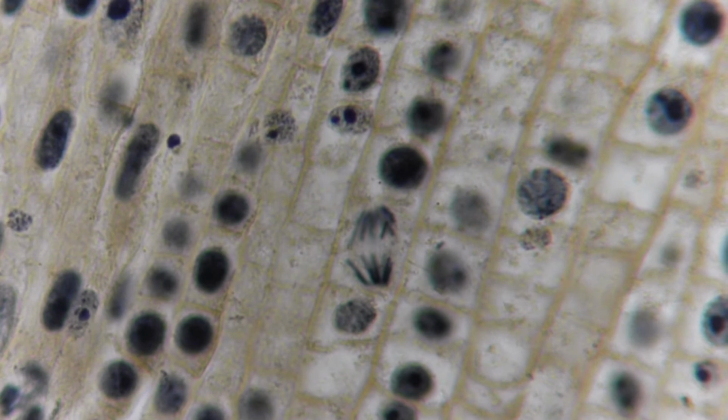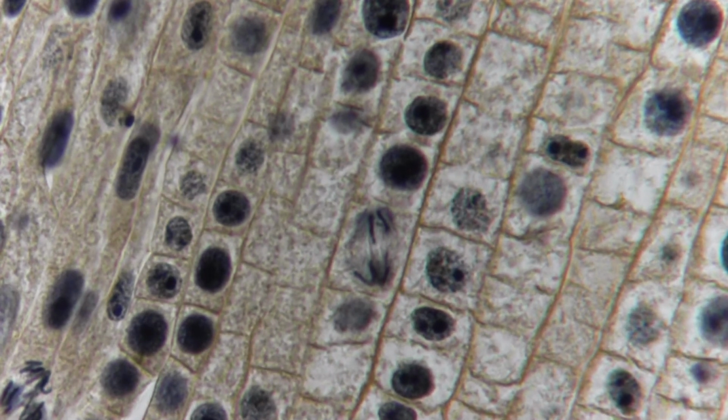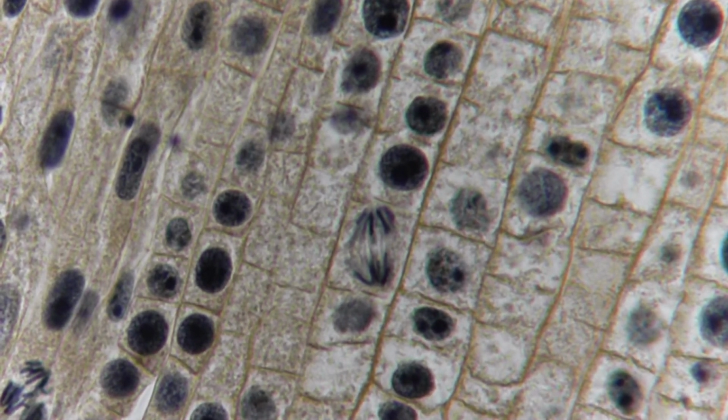Now they're kind of at an angle, and I want to focus up and down on it. Now you can see the spindle figures as I'm looking through the scope. Now the camera may not capture it as distinctly as I see it here. So you see the chromosomes have, half of them went to one end of the cell, and they migrate kind of like to two different poles. And so it looks like a bunch of V's, and they're attached at the center, and so that's anaphase.